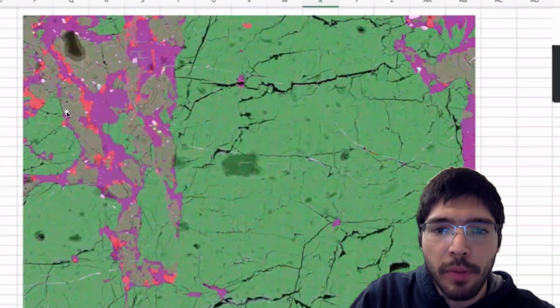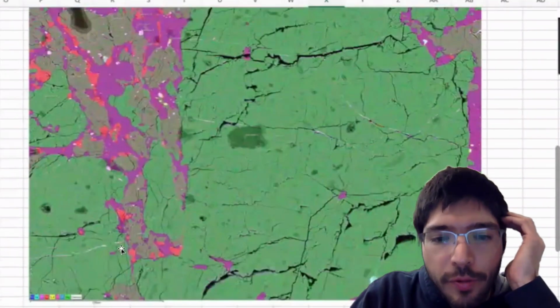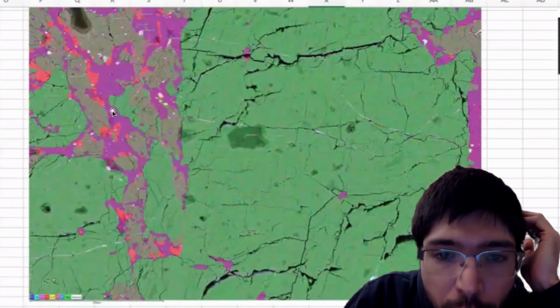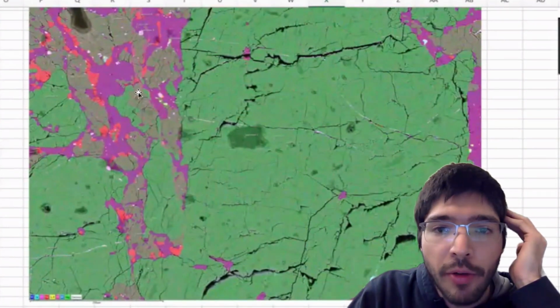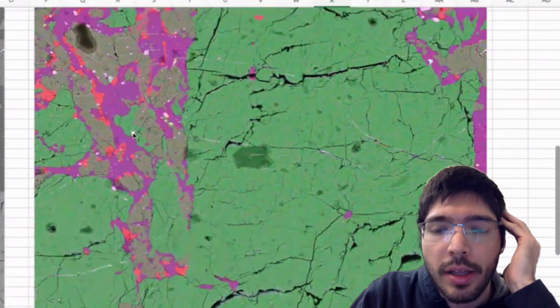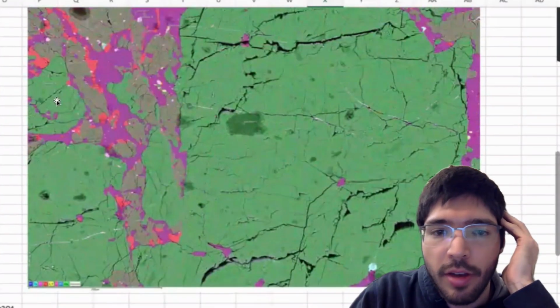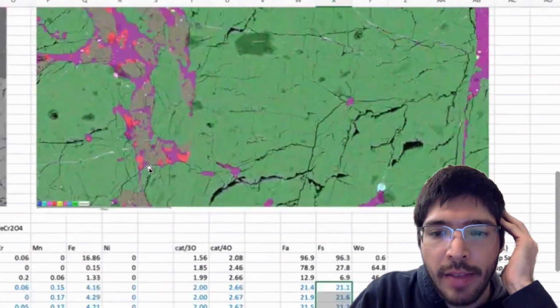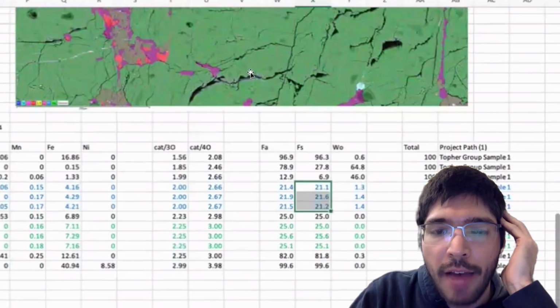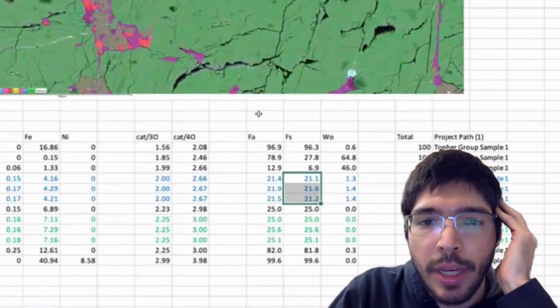This is the purple. And that is feldspars that are, some of them, reaching larger than 50, 100 microns in size. So this is clearly what we call an equilibrated chondritic texture. This is a very nice example of that. And so just from seeing this, I can tell right away that I likely have an equilibrated meteorite.